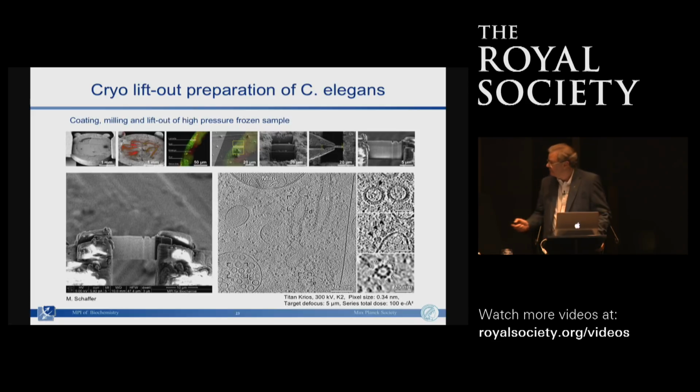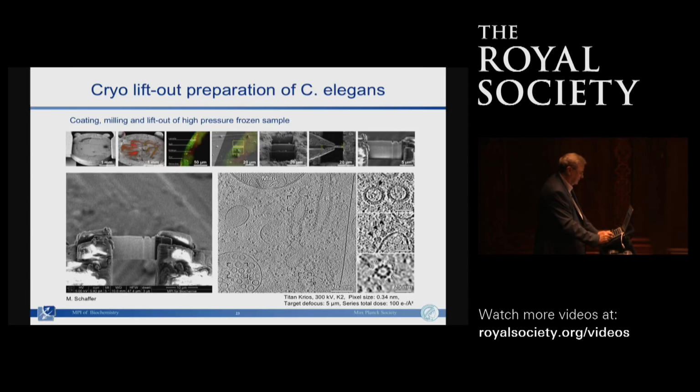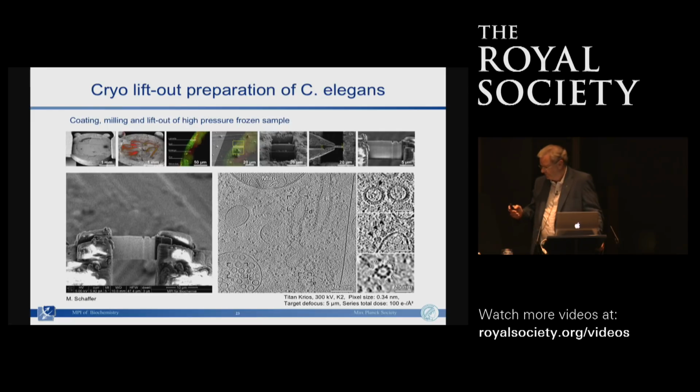So what you see here is a tomogram of a cell from the gut of C. elegans, and you see in these magnifications here, these are coated vesicles. These are ribosomes sitting on the endoplasmic reticulum. If we average them, we can go to a resolution of 10 angstroms or so, or microtubule. So this method, which is still not routine, I have to confess, enables us essentially to target any volume, even in a tissue or in a multicellular organism.